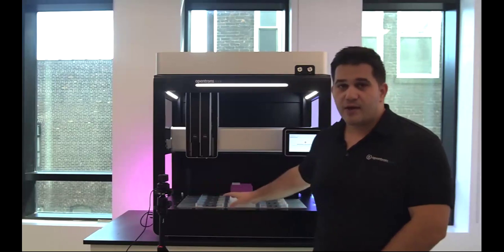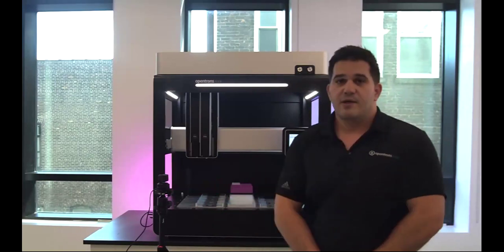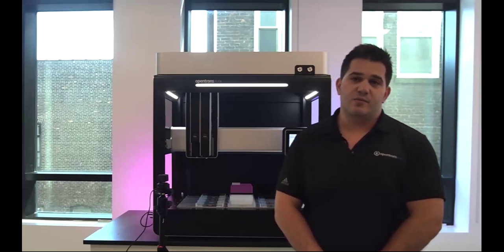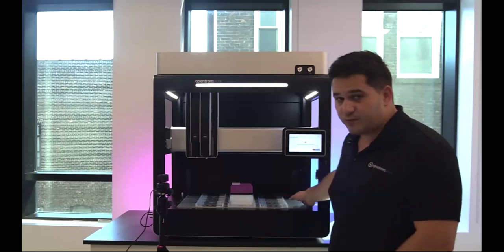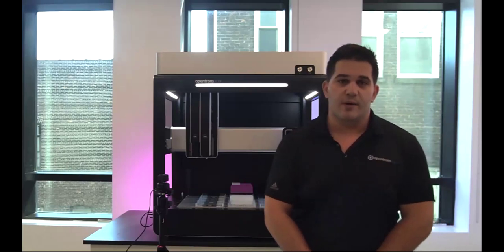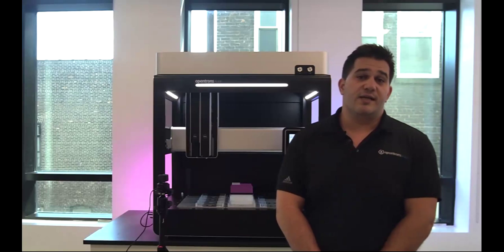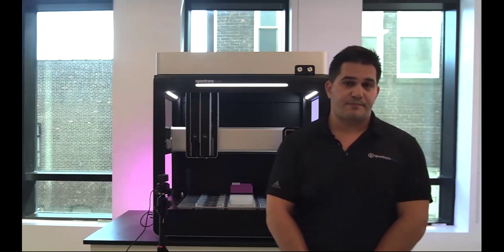Now, moving on to the deck. The deck of the robot right over here features 12 standard slots, one being a trash bin, like I said, where tips, labware, and modules would be placed. We also have expansion slots, which we have 4 of, which would be off to the right of the main deck, which would be right over here. And these would be used to hold extra tips and labware. The gripper can access the 12 standard slots, but can also access the 4 expansion slots, which allows you to bring additional labware onto the main deck so that the pipettes can access them.